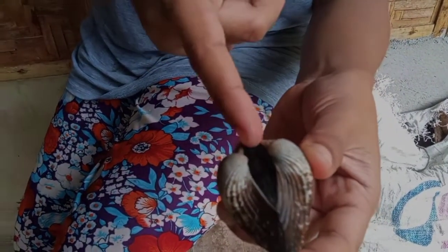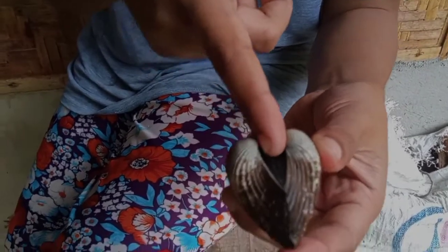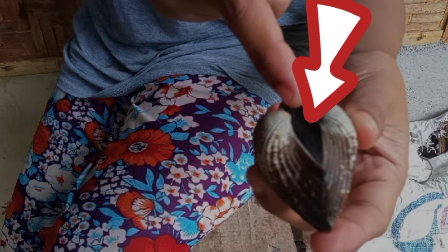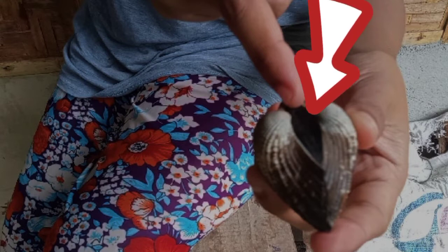This is the ligament. As well as connecting the two bivalve shells together at the hinge line, the ligament also functions as a spring, which automatically opens the valves when the adductor muscle or muscles that close the valves relax.